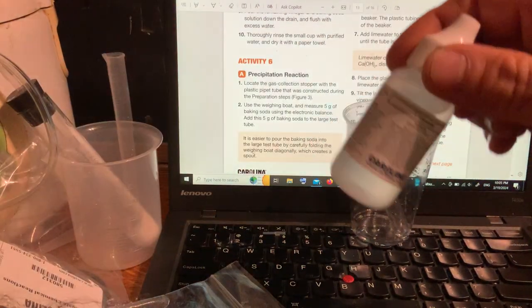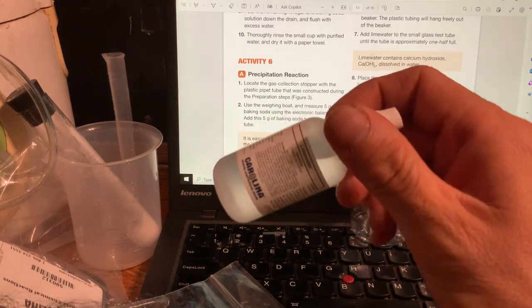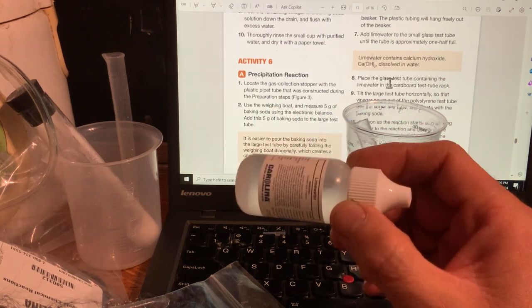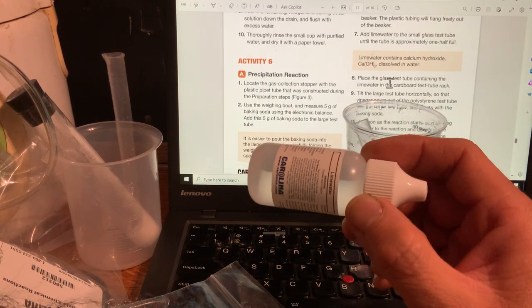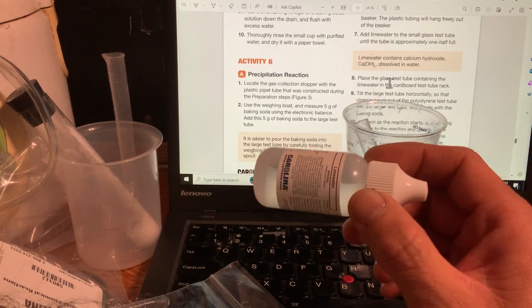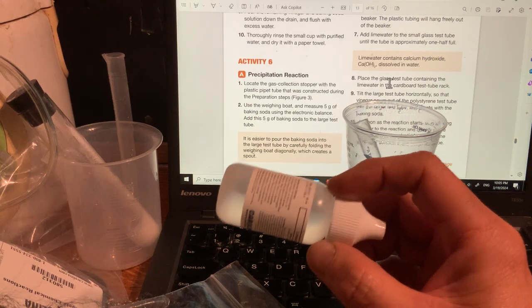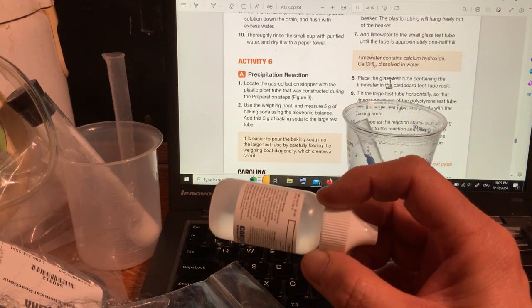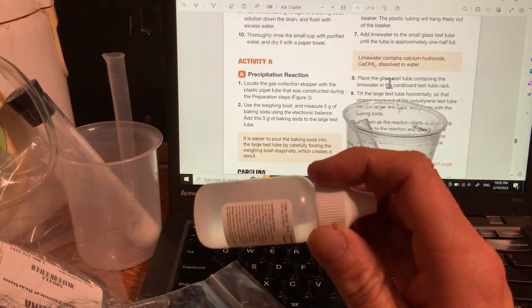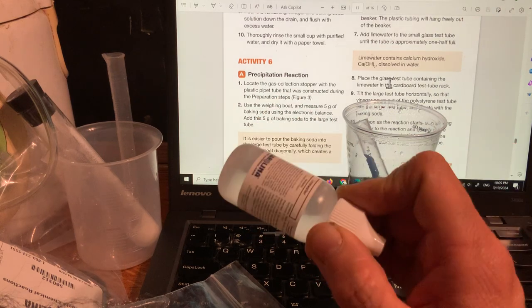Now, the reason why I'm doing this experiment and I didn't do the other experiments is because lime water is perfectly safe, but it is a saturated solution of calcium hydroxide, meaning you cannot dissolve any more calcium hydroxide in this water. That's why this water is special. It's lime water. And the chemical reaction that I want you to observe here is the formation of calcium carbonate. Calcium carbonate is just chalk, but when it forms in water, it looks like a cloudiness. So I want you to see cloudiness forming in the lime water.